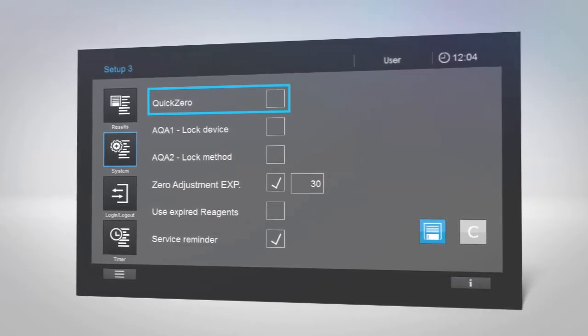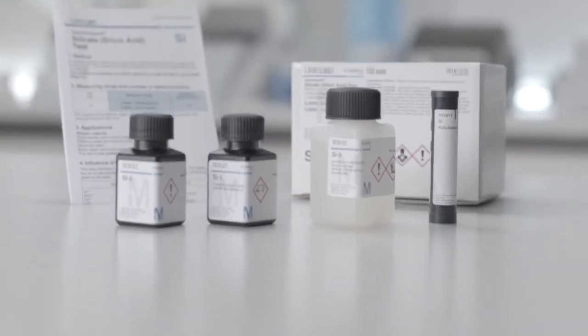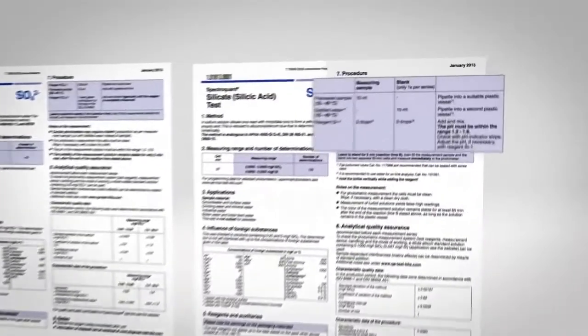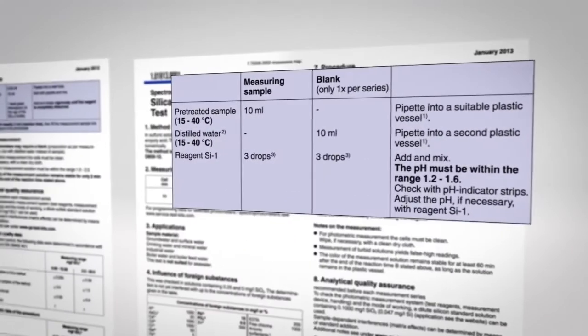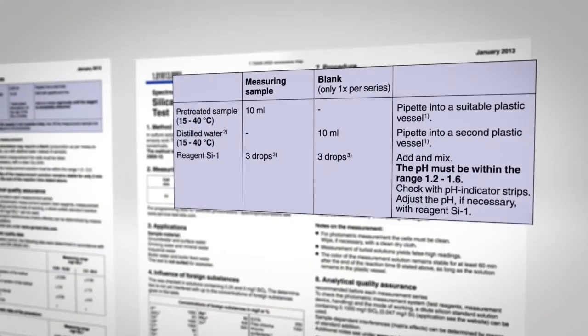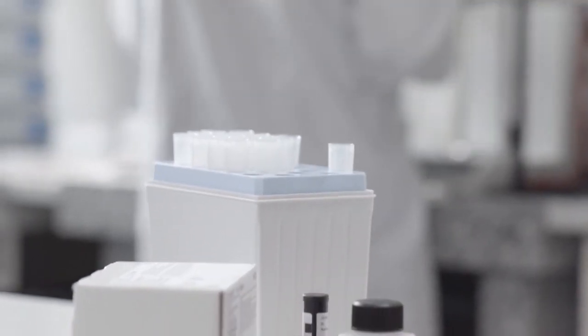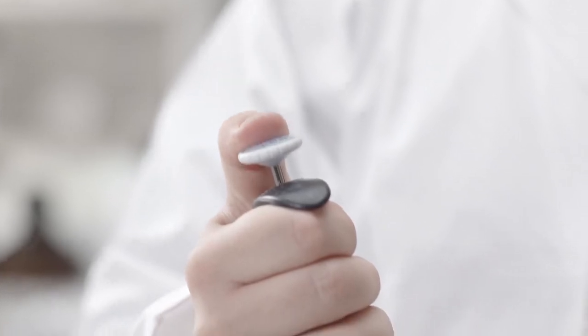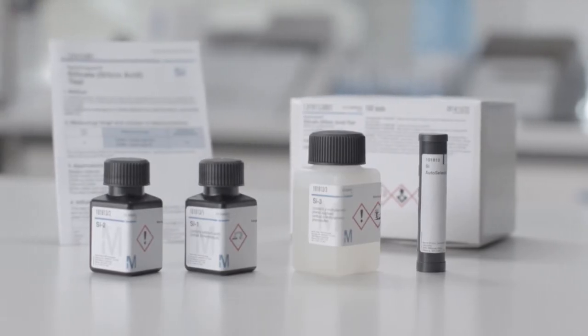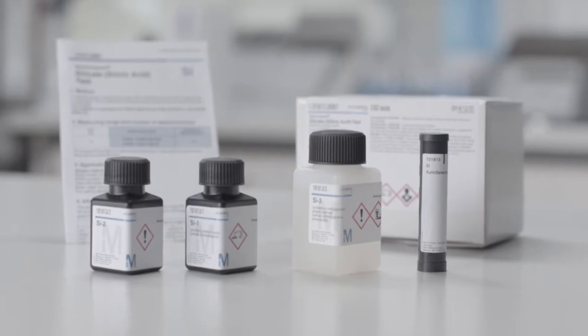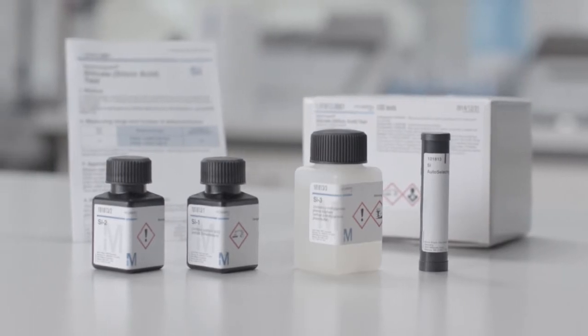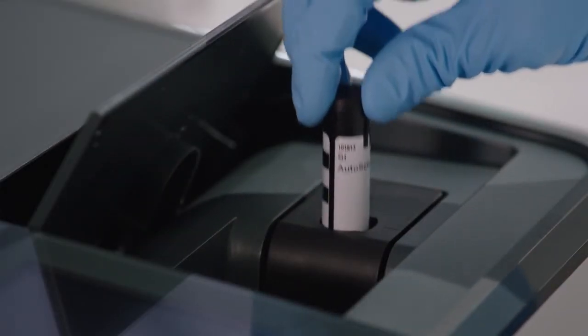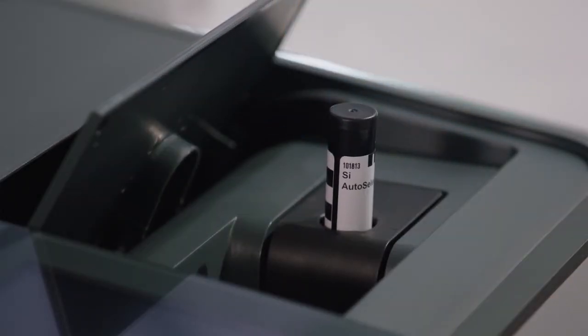If you are using one of our reagent test kits, prepare your sample as described in the kit. These convenient test kits contain highly stable, ready-to-use reagent mixtures and an auto selector, which also uses our LiveID barcode system to automatically select the appropriate method in SpectraQuant Prove.